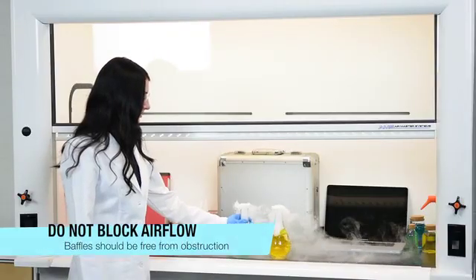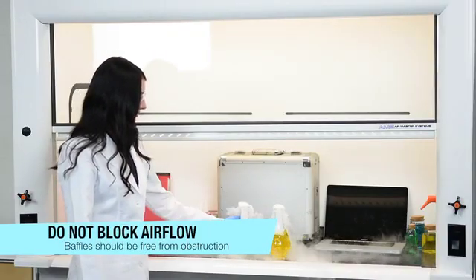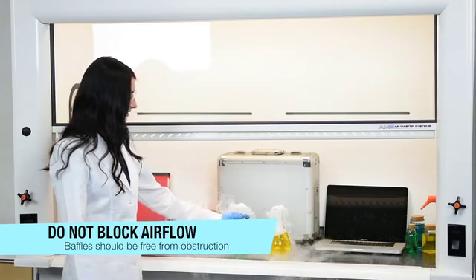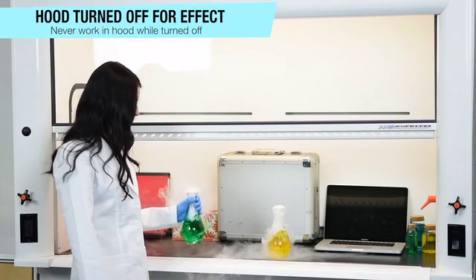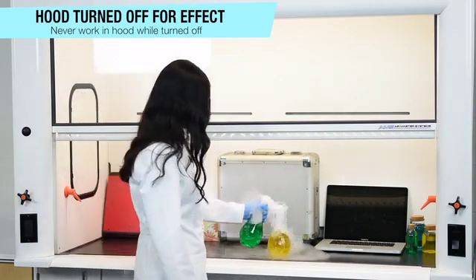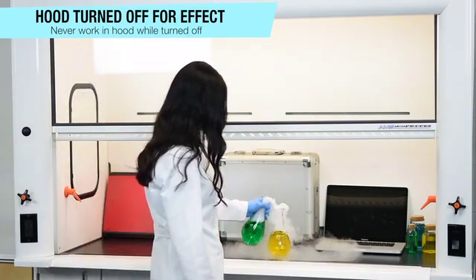A fume hood is not a storage compartment. Make sure that you keep all objects out of the fume hood that are not a part of the experiment. This will block the appropriate air flow and will cause contamination to the room. Breathing this contamination can be very harmful if not fatal.